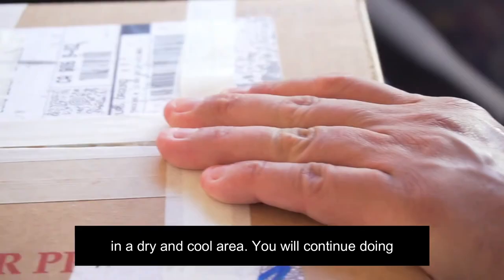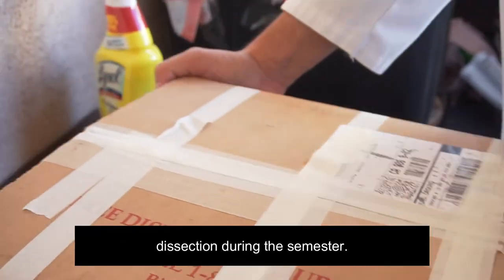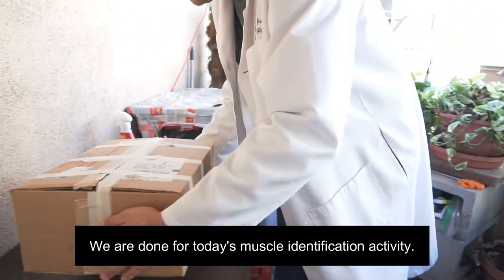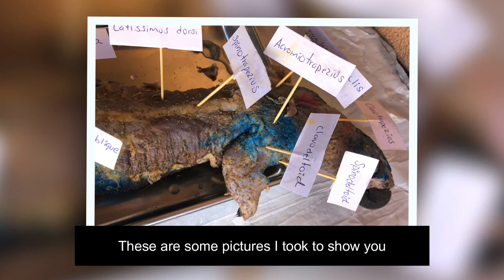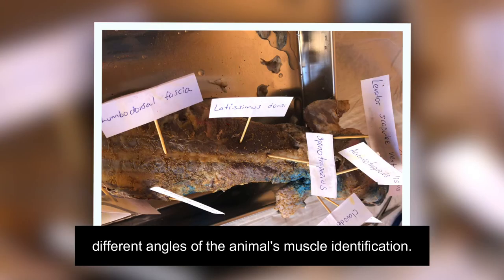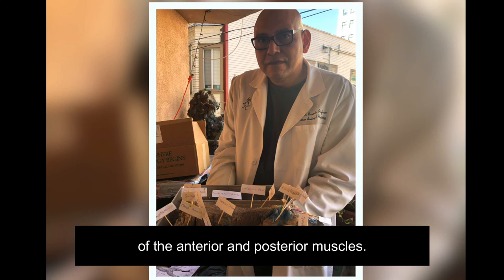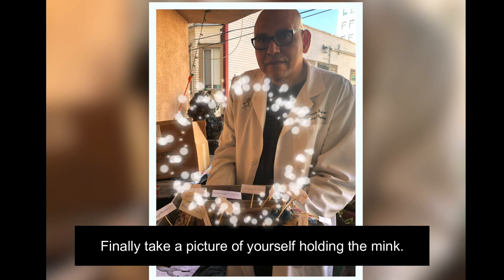You will continue doing dissection during this semester. We are done for today's muscle identification activity. Great job! These are some pictures I took to show you different angles of the animal muscle identification. You have to submit four to five pictures of the anterior and posterior muscles. Finally, take a picture of yourself holding the mink.